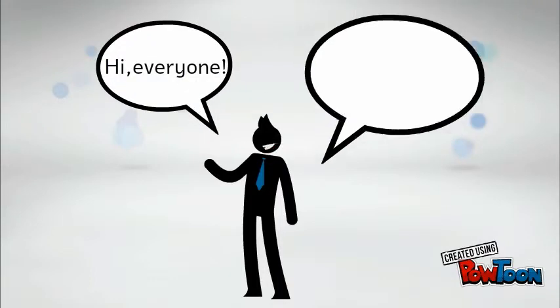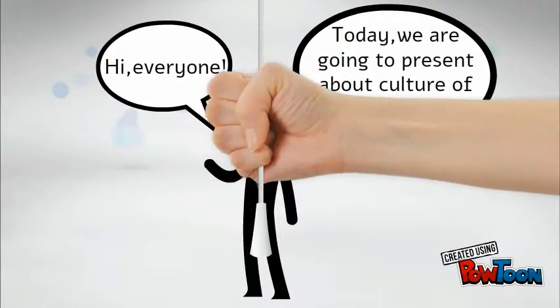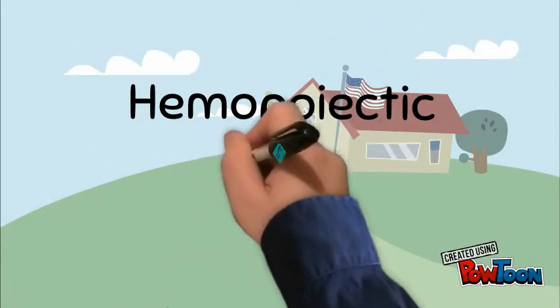Hi everyone! Today we are going to present about culture of specific cells. Hematopoietic cells.